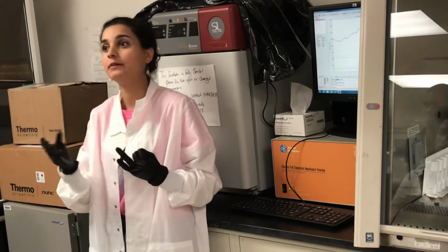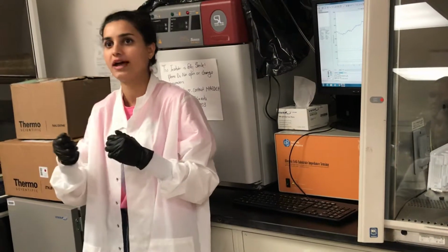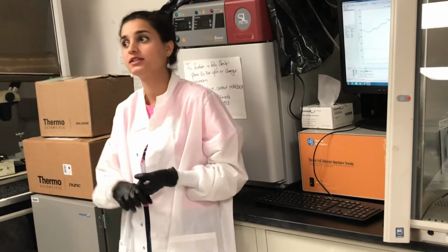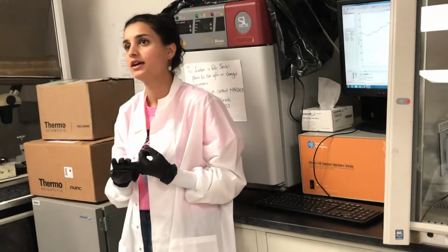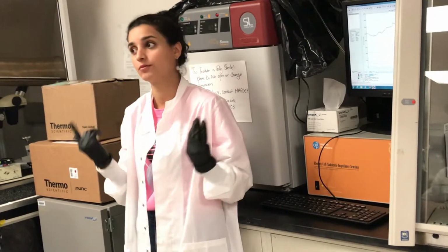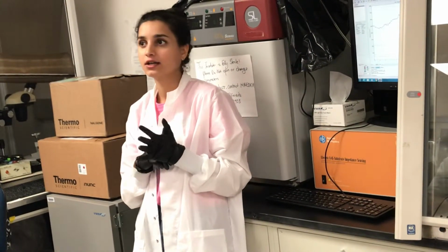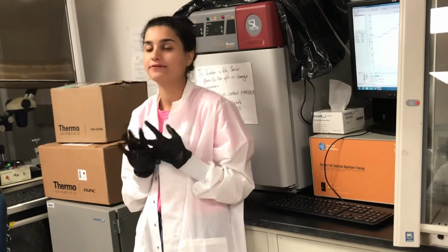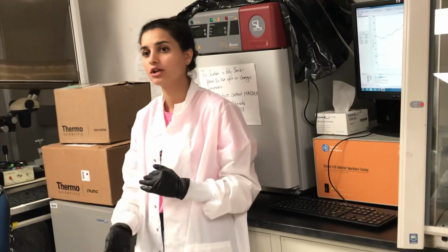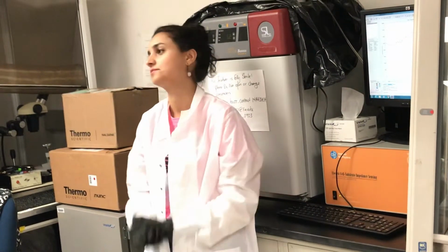For example, we put in blebbistatin. Blebbistatin is a drug that stops the heart rate. So in cases like fibrillation, you add blebbistatin to stop the heart rate and then restart it again. And then we see ATP effects. ATP increases heart rate, so we do that. Then we monitor how much oxygen they are using, so respiration, because it's an important part of cell growth. We also monitor how they eat in terms of glucose, lactate, and fatty acids. Those are important things for cells to grow. If it drops, we give them more. If it goes up, we decrease it. So we have all of that under control in that little chip.